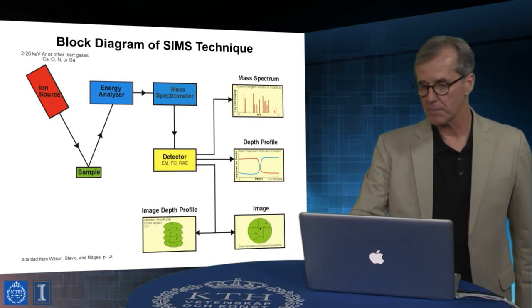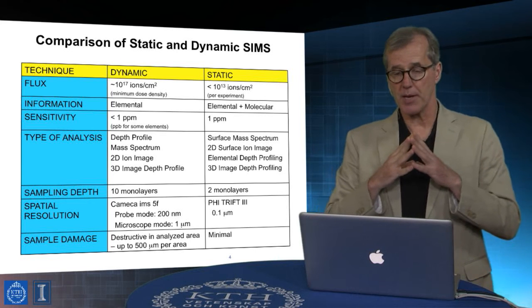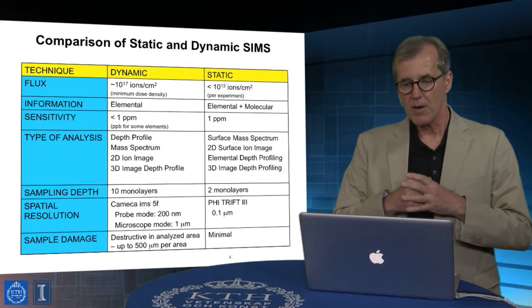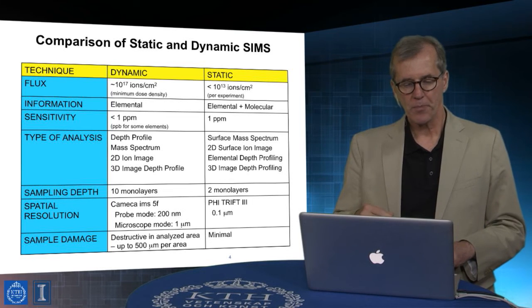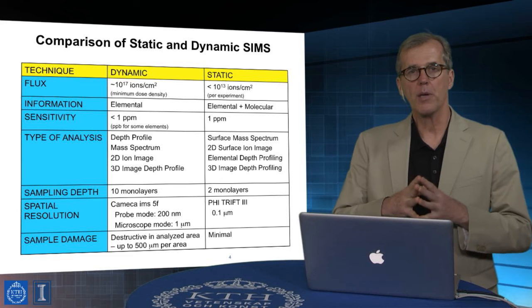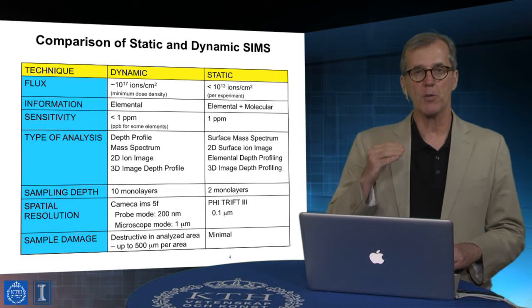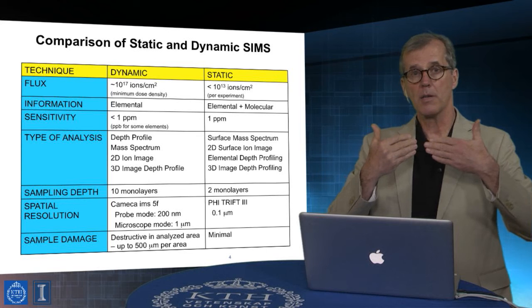So surface to bulk. Now there's two words you'll hear used to describe the SIMS technique. One is, you might hear people say SIMS. Typically when they just say SIMS, they're talking about dynamic SIMS. And dynamic SIMS, with some caveats, is principally a measurement that's done at relatively high ion fluxes, because dynamic SIMS is a measurement protocol that's used to look at materials more into their depth.